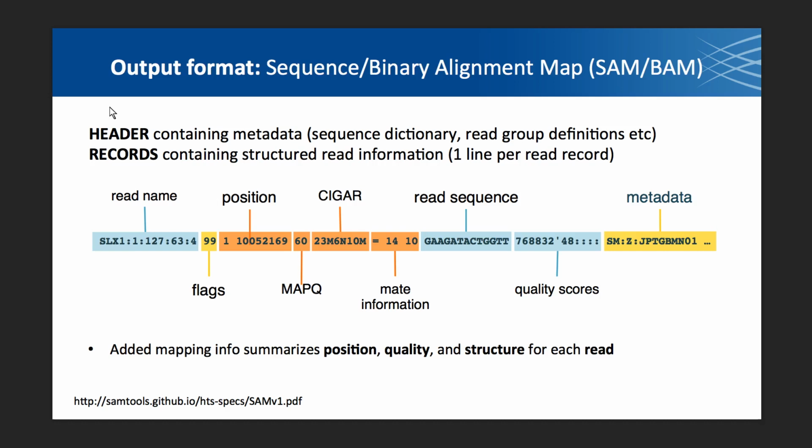The equal sign means it's the same chromosome, that's good. If it's not the same chromosome, it means that something strange is happening, right? If read 1 is on chromosome 1 and read 2 is on chromosome 15, they came from the same molecule, and so either there's a strange fusion going on between chromosome 1 and 15, which is possible. In cancer, everything is possible. Or it's a part of the genome that doesn't map very well. That's also possible. Or your sequencing quality is very bad. Or your data prep is very bad. There's a lot of things that could go wrong. If that's happening a lot, that's usually an indication of something strange.